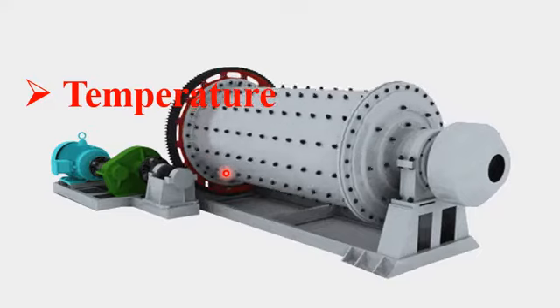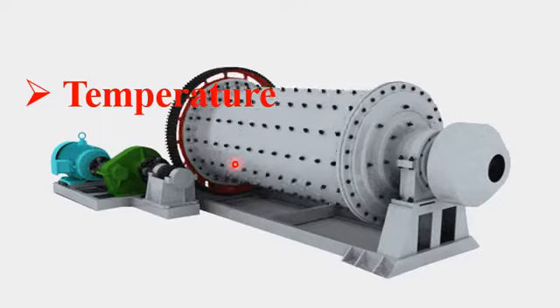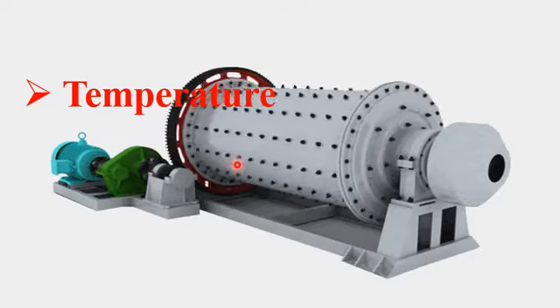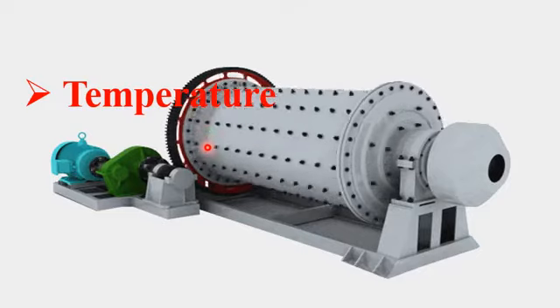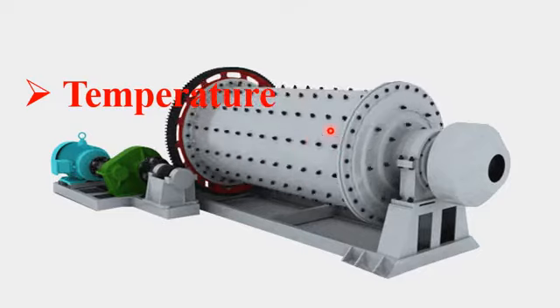In some cases, there is a possibility of agglomeration or accumulation of nanoparticles with each other, and they may cause nucleation, and the size of the nanoparticle may increase due to temperature. So you have to consider the temperature and the frequency inside the ball mill chamber or ball mill drum.